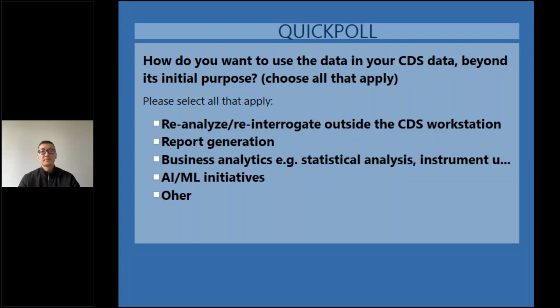Is it to generate reports? Do you want to use it for business analytics, statistical analysis, to find out how often instruments are used, how much they're used, which ones are used? There is so much interest in this area right now for AI and ML. So you do want to be able to use the data that is in your CDS for data science initiatives.